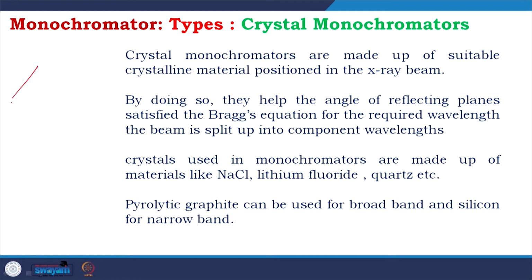One is flat and straight and another one is bent. The bent one is helping the circular light to diffract, and they are mostly working on protein.